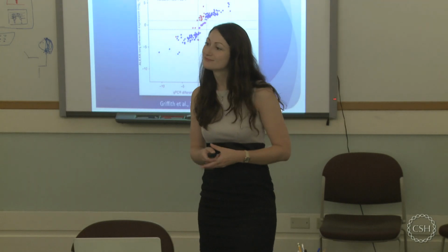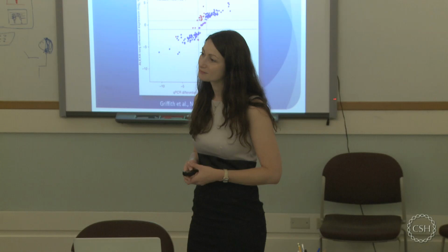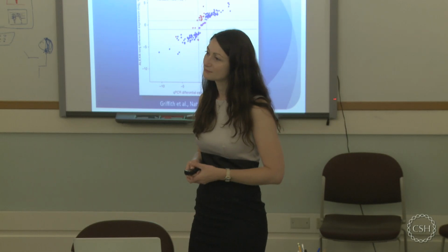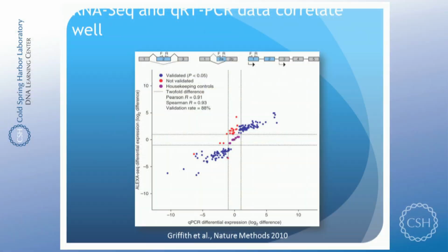Is there any correlation between the Q value associated with the log difference and the validation? It looks to me like most of your red dots fall within about one-fold or two-fold. Yeah, so the cutoff line here would be by 1, and this is log 2-fold, so it means these are 2-fold or more overexpressed as determined by RNA-Seq. However, they could not be found in the qPCR.